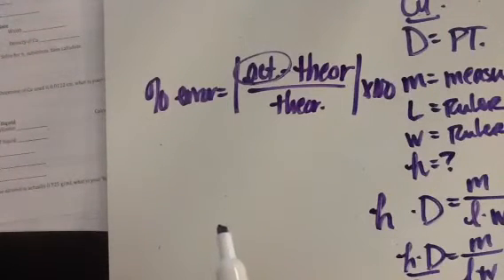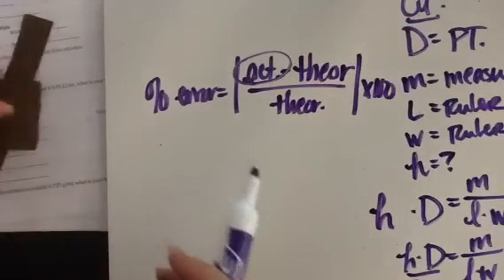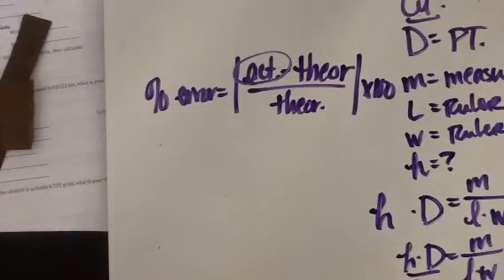So, part 1, do your object. Part 2, thickness of copper. Part 3, the density of the liquid. So there is a bottle of alcohol at each of the lab stations. So the density is not 1 because it's not liquid water. It is an alcohol solution. And I'm asking you to take out between 20 and 30 milliliters of solution. Does it matter that it's exactly 20? No, as long as you know exactly what you have, okay?